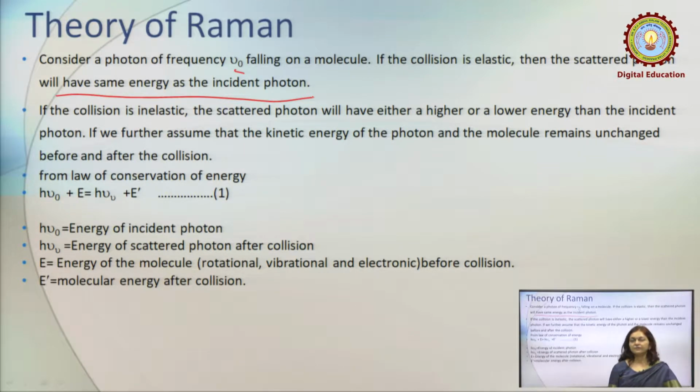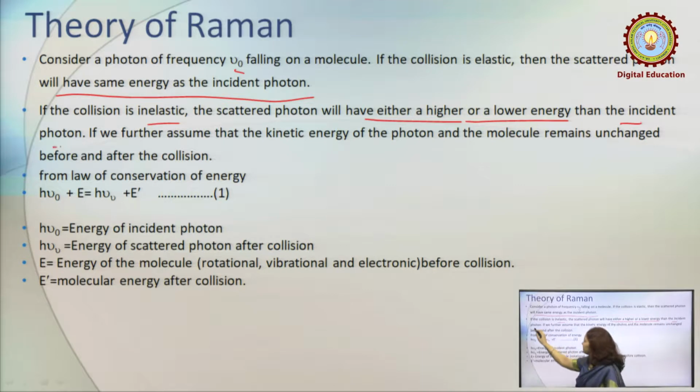But if the collision is inelastic, the scattered photon will have either higher or lower energy than the incident photon.